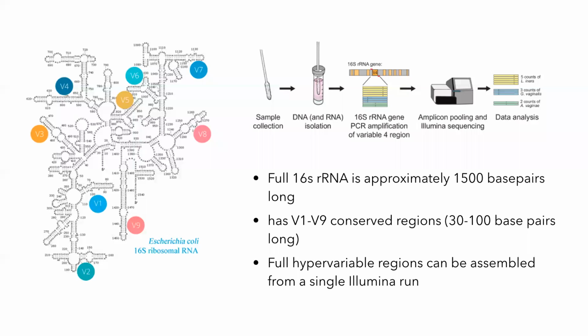Conversion into reads cannot differ in duplicates or triplicates, and if it differs, then there might be error. Is it correct? So you're talking about paired-end reads, as I understand, right?